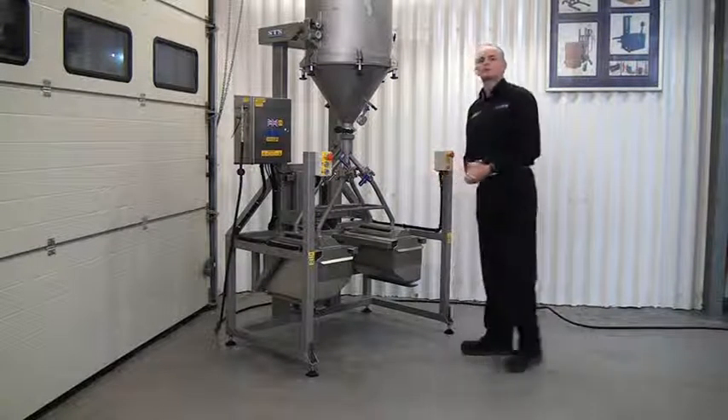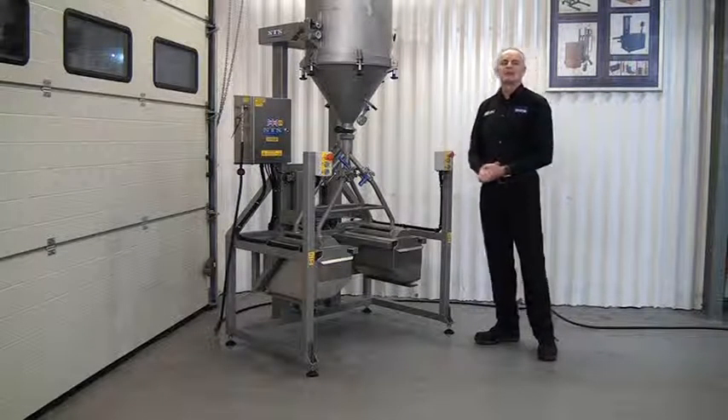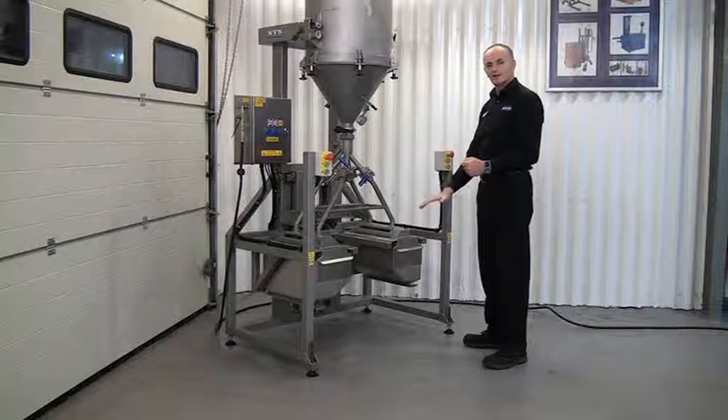You keep the green buttons pressed until the whole system is together, then it will stay in place. If you only bring it up halfway and let go of the green buttons, the unit will then go down.